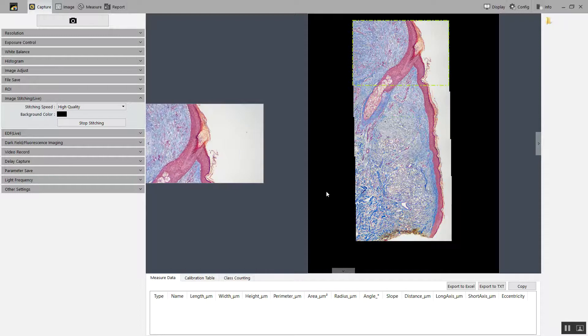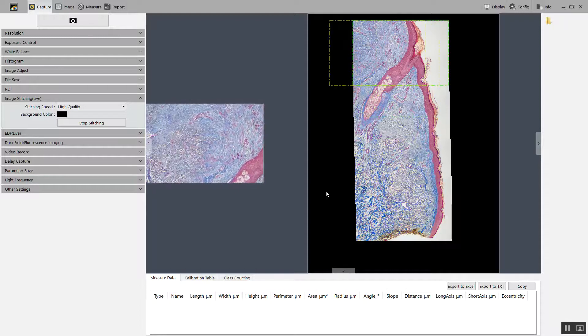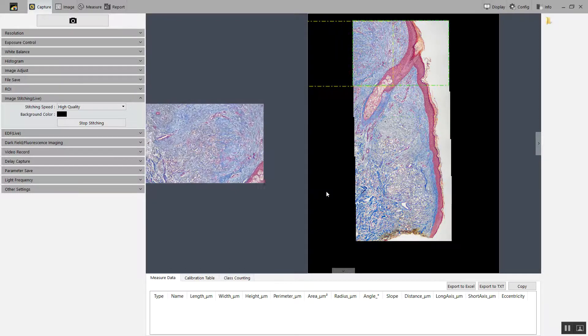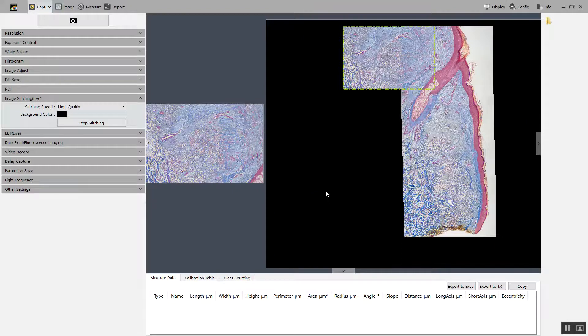Make sure that there's always some overlap. You can see it doesn't build very quickly.